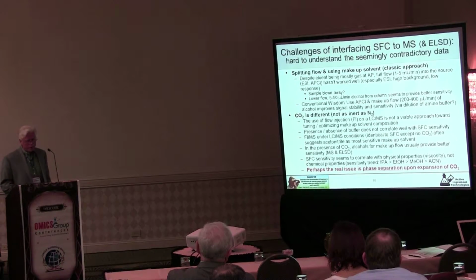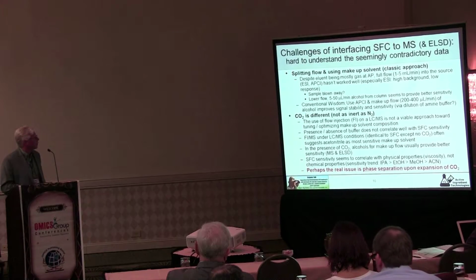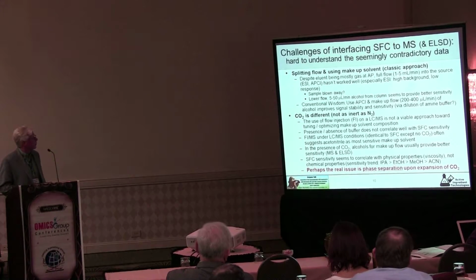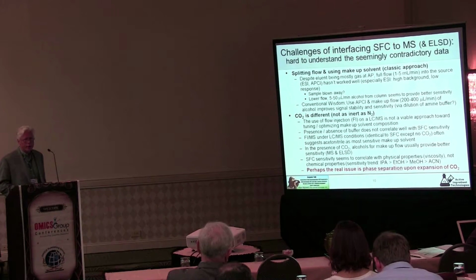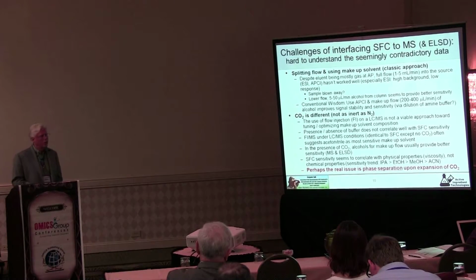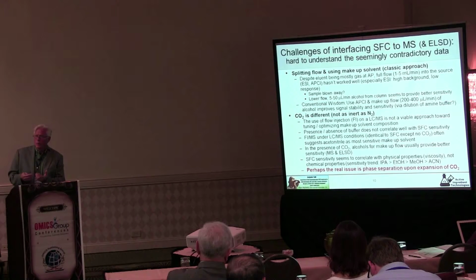So we started with the challenge, with the ordinary approach to interfacing these detectors. We were not really happy with it. No, I haven't really seen anybody that says that it works well. And we tried a lot of different things to try to understand why this was not working well. One of the things we wondered, is CO2 different? Is it not as inert as nitrogen? Is that somehow playing a role? Because some of the things we were seeing didn't make sense. We thought we should be able to control things pretty well with solvent choice that we're adding in as makeup. And it turned out not so. As a matter of fact, it seemed to defy what we already knew.